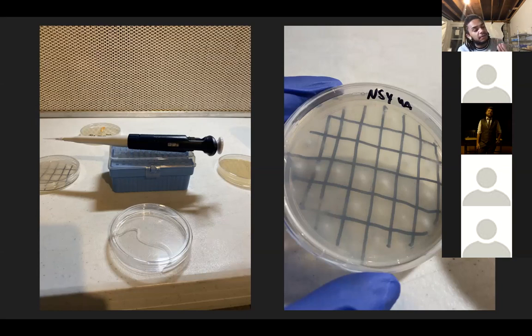So some people will just drop spores into a little glass container and shake it up with distilled water, and then dilute it multiple times into sterile water, into sterile water, until there's not a lot of spores. Or you can just do it by making a grid on a clean petri dish, and you're going to want to use water agar for this.